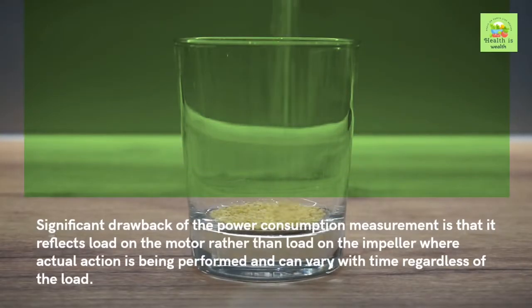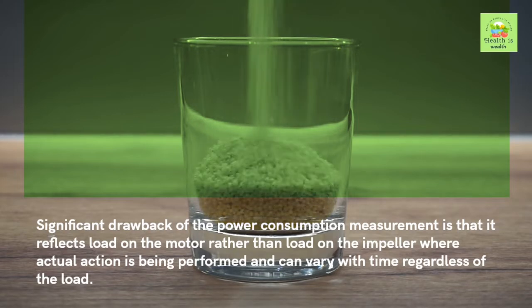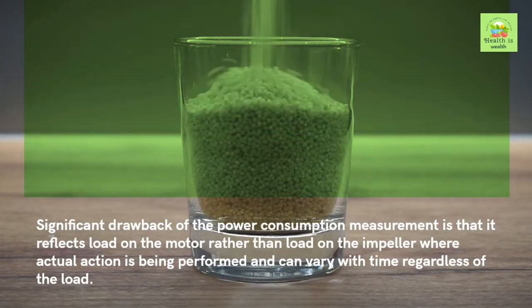A significant drawback of the power consumption measurement is that it reflects load on the motor rather than load on the impeller, where actual action is being performed, and can vary with time regardless of the load. Impeller load.